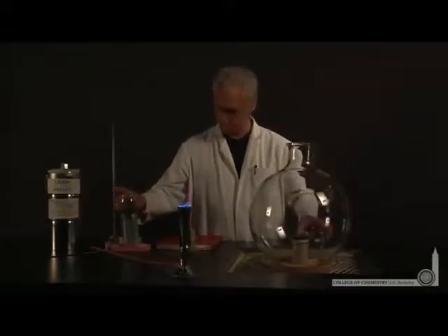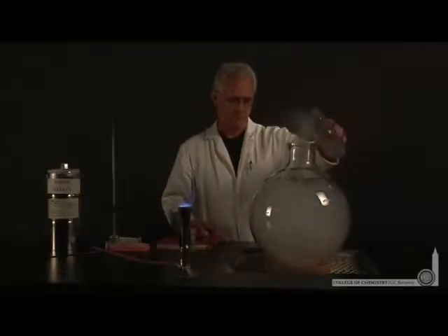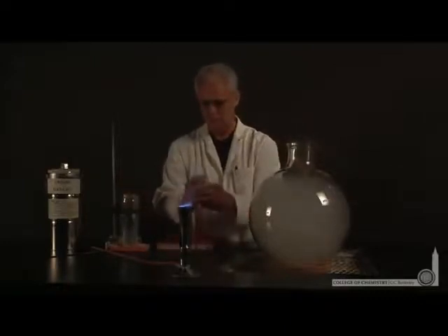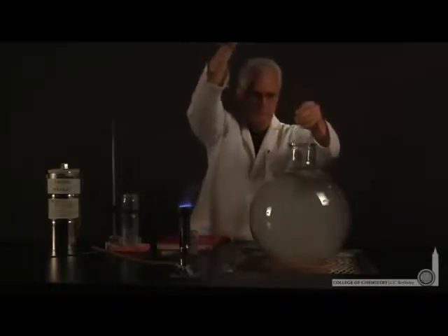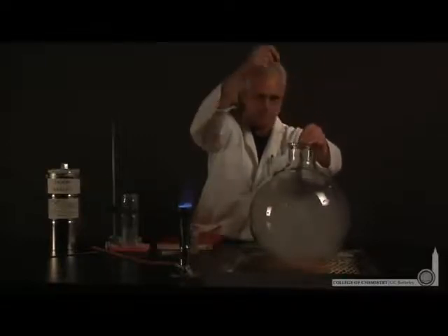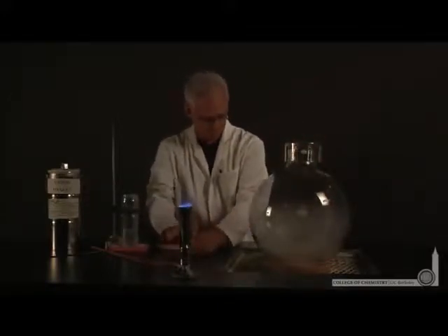We're in the demo lab with Lonnie, where he's going to produce a phosphorus oxide from pure oxygen and pure phosphorus. The pure oxygen will come from liquid oxygen, which he's pouring into this flask. That will drive out all the air and leave an atmosphere of pure oxygen inside the flask. He also has a piece of solid phosphorus attached to the end of a string that he can lower into the bottom of the flask.